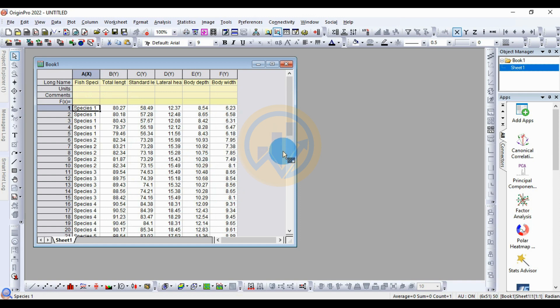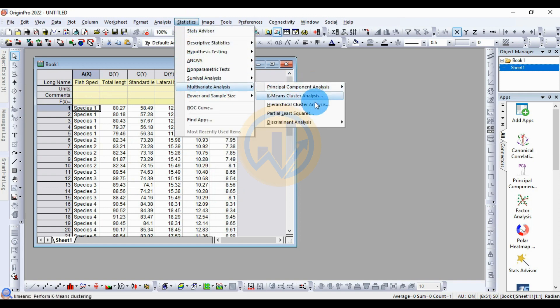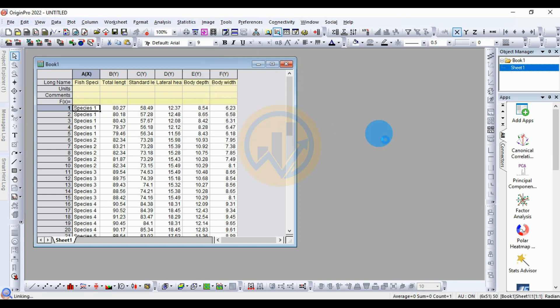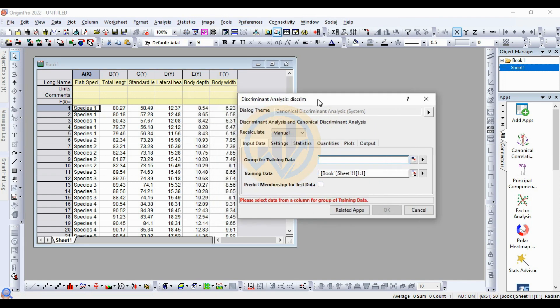Go to the Statistics menu, click Multivariate Analysis, then Discriminant Analysis — the canonical discriminant analysis. This opens a new tab for the discriminant analysis.